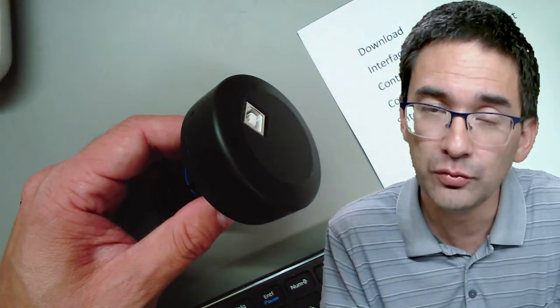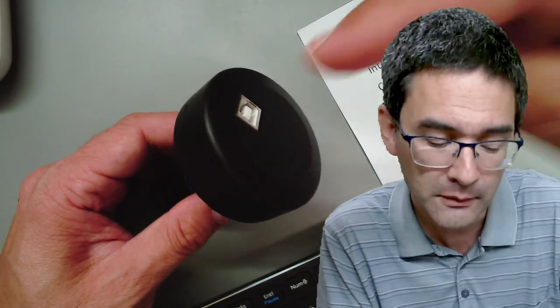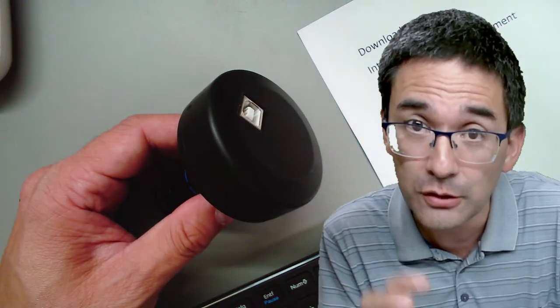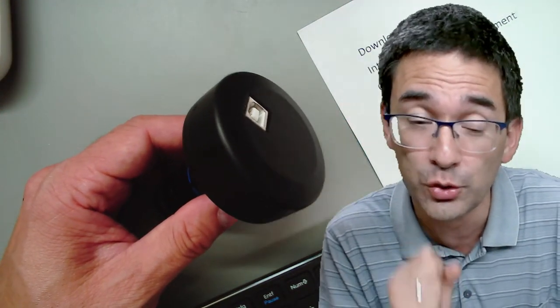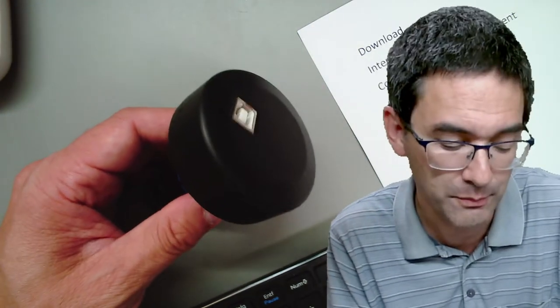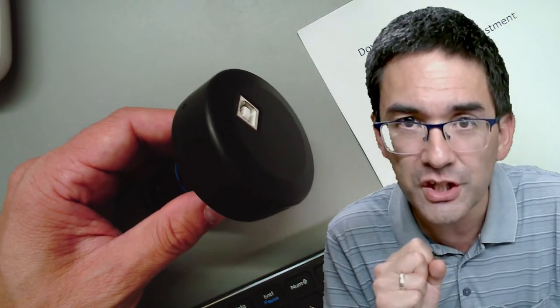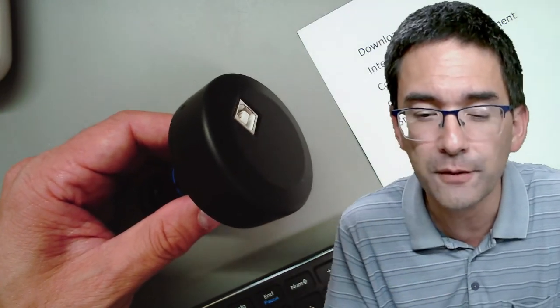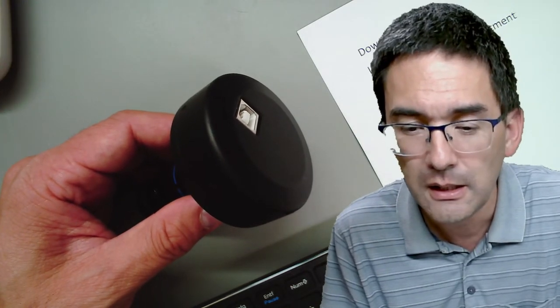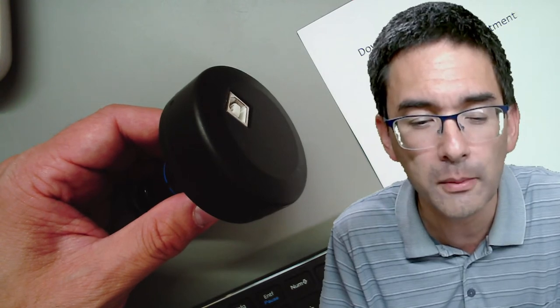Okay, so you only get a relatively smooth video or smooth picture if either the resolution is low, so you have to go down with the resolution, or you need a faster connection, USB 3. These are expensive, those cameras. Okay. However, there are some other adjustments that you can do to increase the frames per second. Okay. And to do that, you have to see if your program allows this to do.